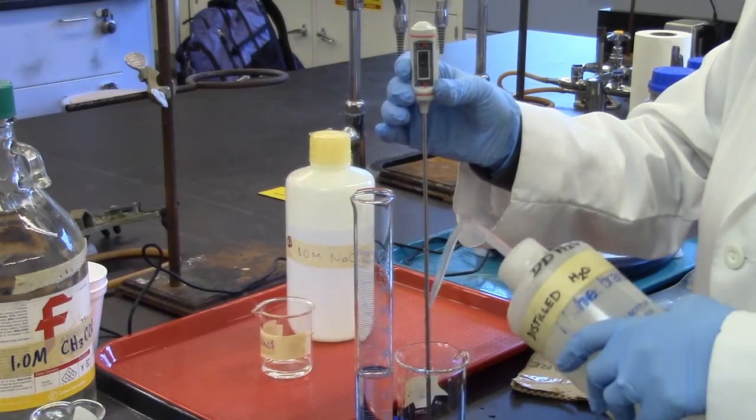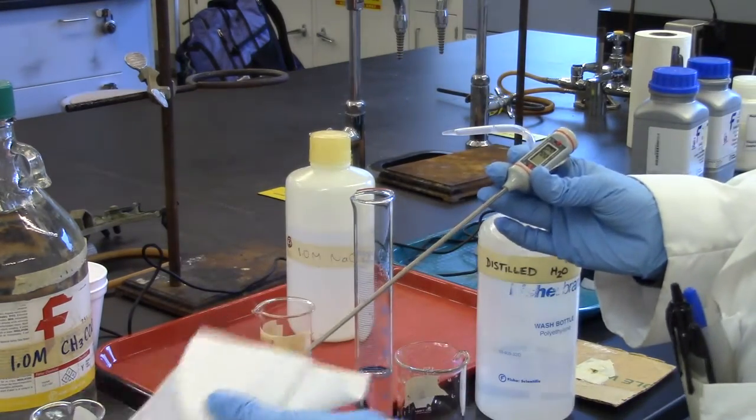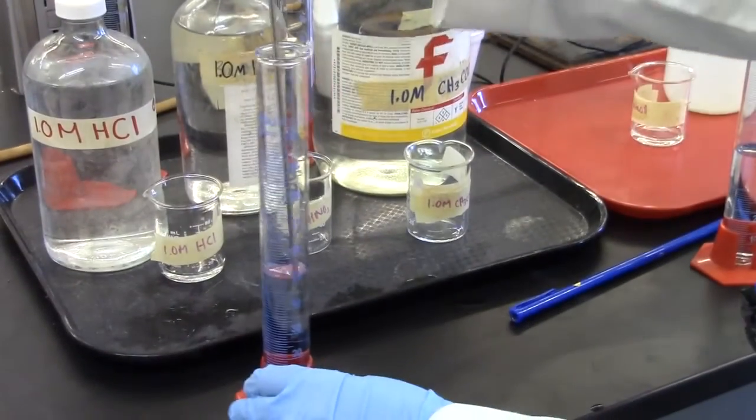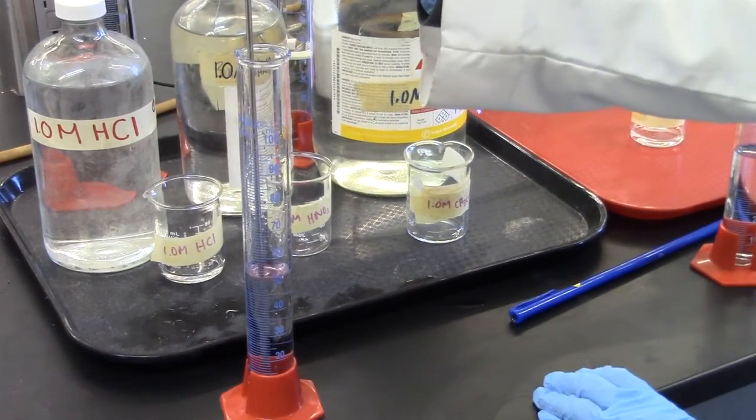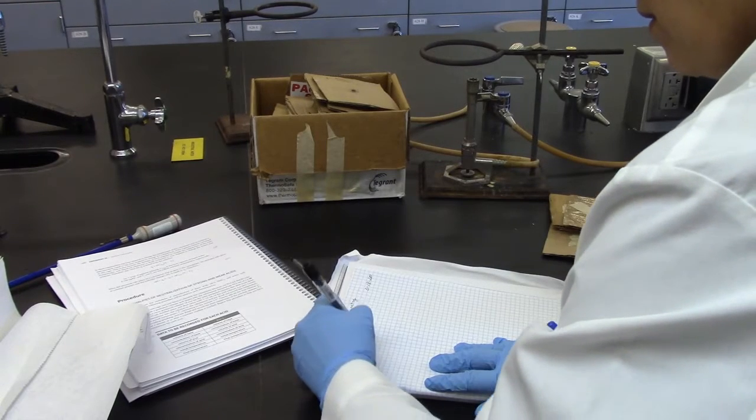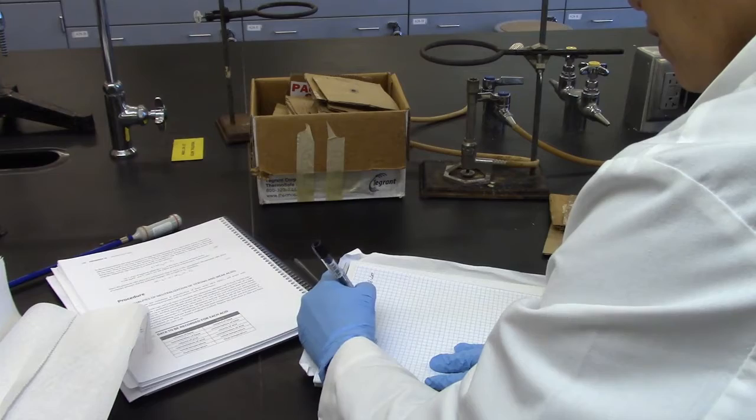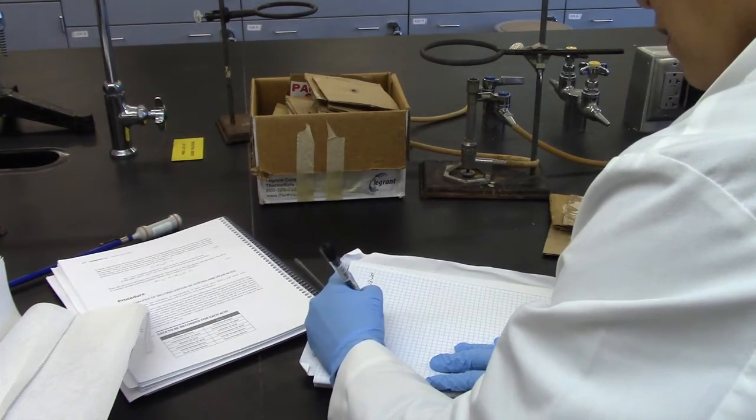Rinse the thermometer off with distilled water and pat it dry with a paper towel. Next, measure the temperature of the hydrochloric acid. Record the temperatures of the sodium hydroxide solution and the hydrochloric acid solution.